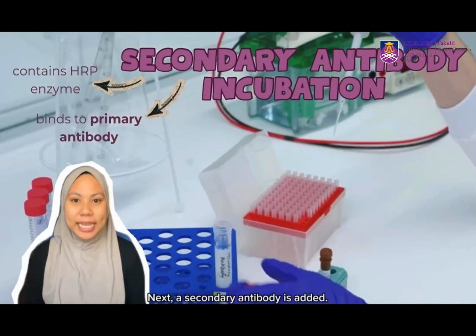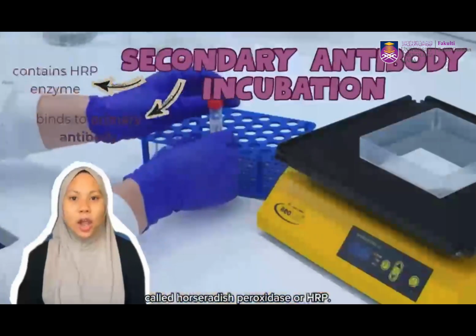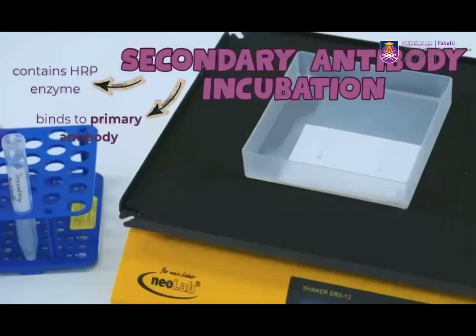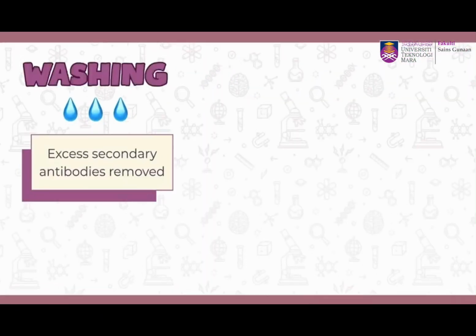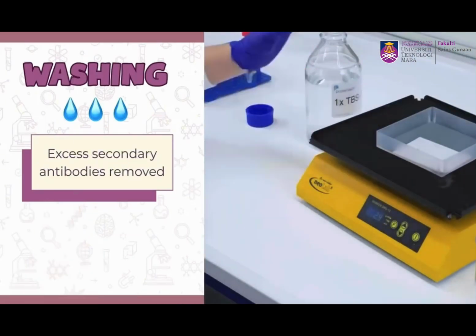Next, a secondary antibody is added. It binds to the primary antibody and carries an enzyme called horseradish peroxidase, or HRP. The membrane is washed again to remove any excess secondary antibodies.